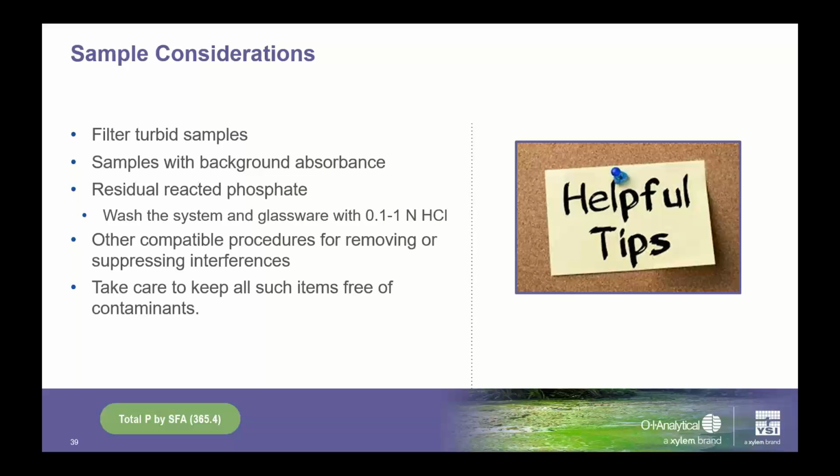What I have done is chlorophyll extractions, because you're trying to understand the relative ratio of algae in that biofouling to everything else that's in the biofouling. So I would recommend doing that with a chlorophyll extraction.